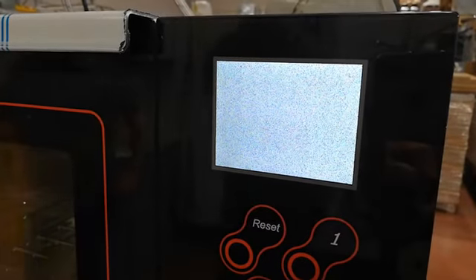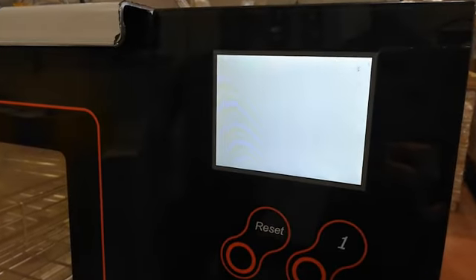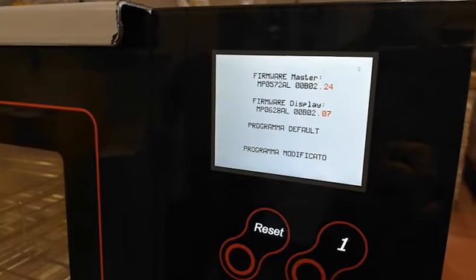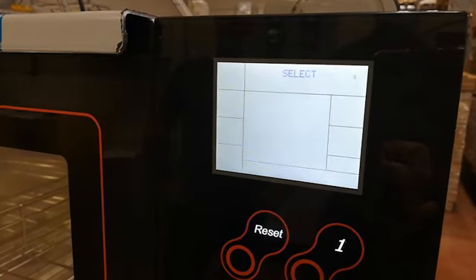During the booting phase, the firmware version of the board and display are shown on the screen. After that, you go to the standby screen of your Tiva 2.